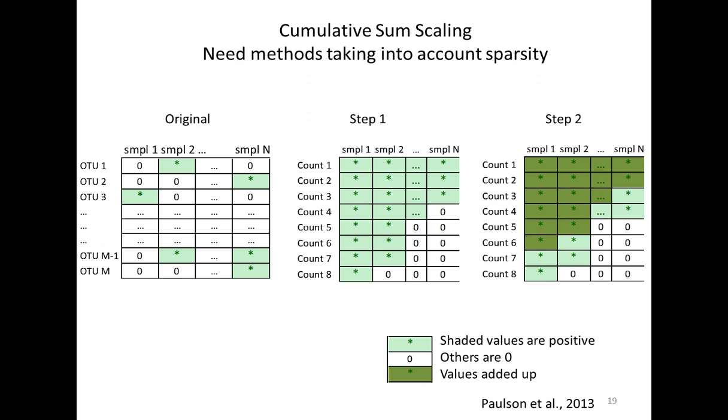Alternatively, we observed similar things in our data, that the low to mid quantiles of the positive count distributions behaved similarly across samples. But it was really the tails. It's these particular bacteria that are very, very abundant after sequencing, that are probably getting preferentially sequenced, that are getting all the sequencing going on, that are really biasing the proportions. So if you were to use proportions, you might downscale certain bacteria that are equally abundant across samples, but because a few samples got a lot more sequencing, and the most abundant bacteria were preferentially sequenced, you're going to get proportions that are not comparable and not representative.